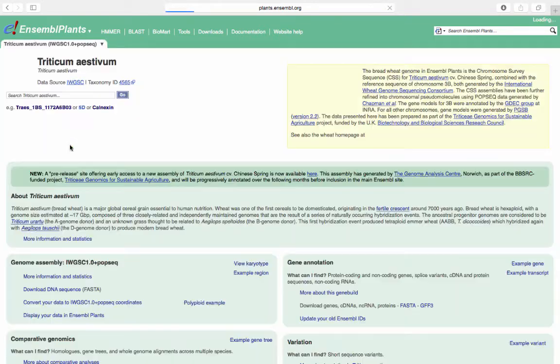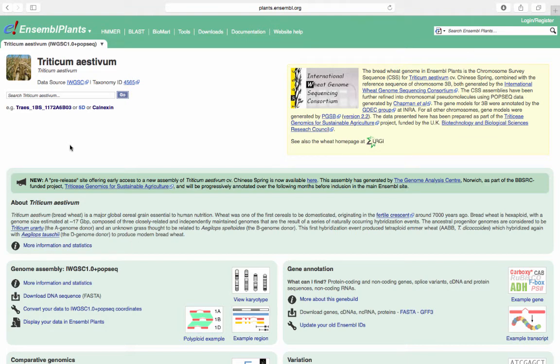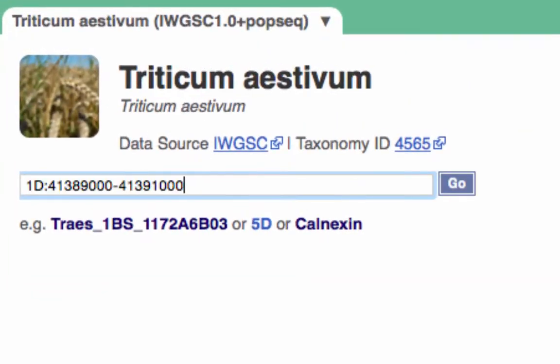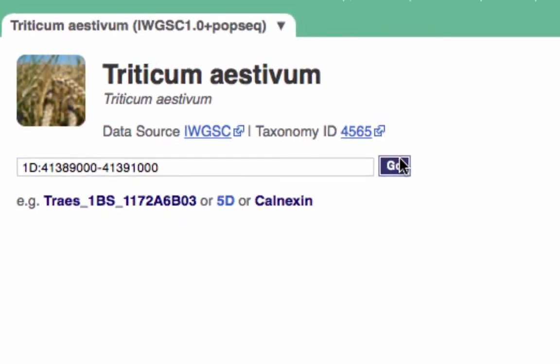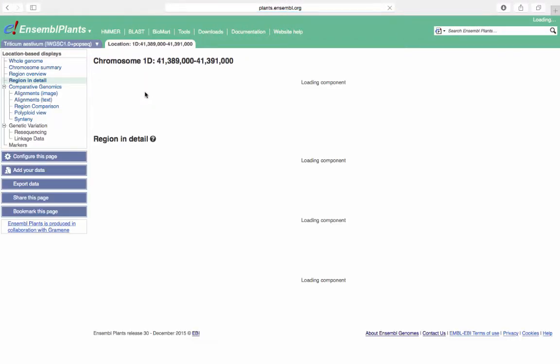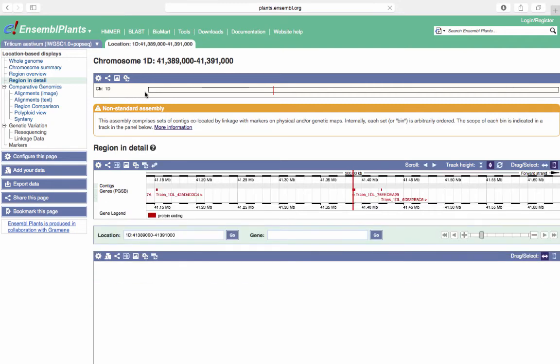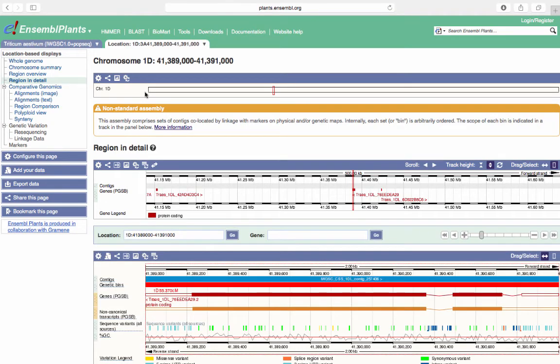Then search for the region 41389000 to 41391000 on chromosome 1D. Click Go. From the Region in Detail view, select Polyploid view from the menu on the left-hand side.